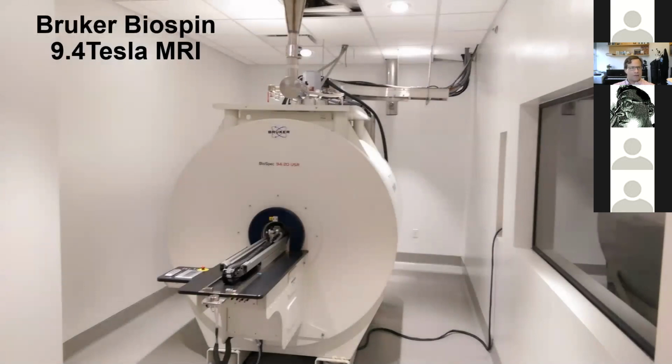Finally, this is the 9.4 Tesla MRI on the 10th floor of the Cancer Center for mice. It's designed for mice and maybe the heads of rats. You could maybe possibly squish a fairly youngish whole rat inside the bore, but it's really not designed for that unless we get a different coil in place. But the goal here is mostly for mouse. So this is a 20 centimeter diameter, including all of the equipment that needs to go in there.